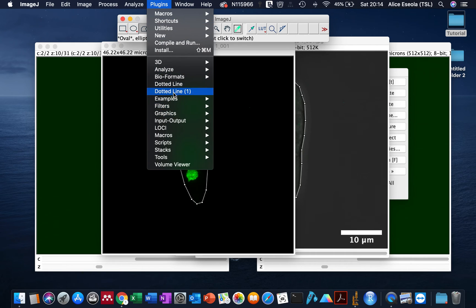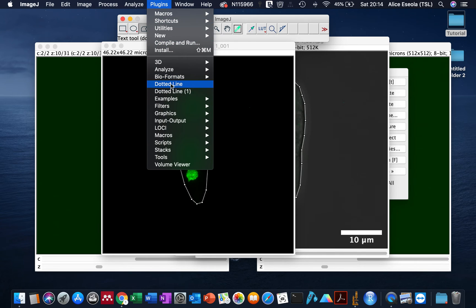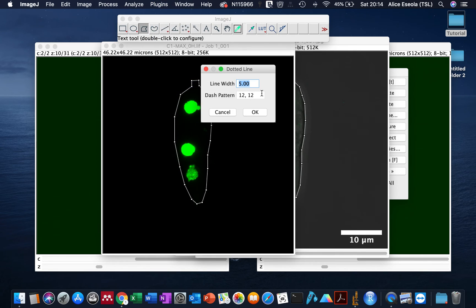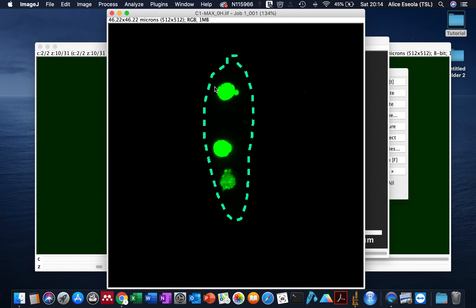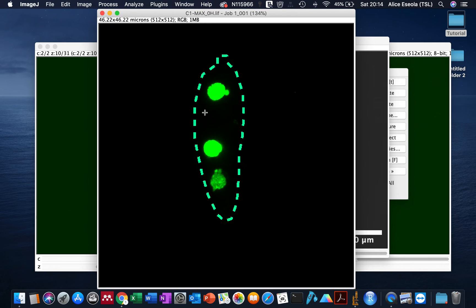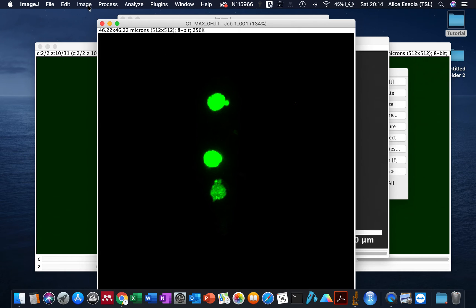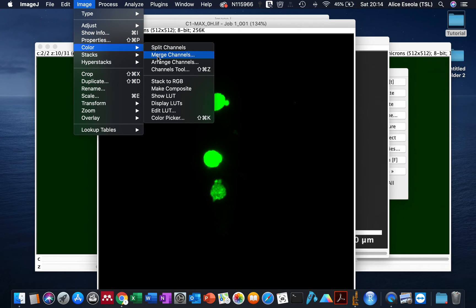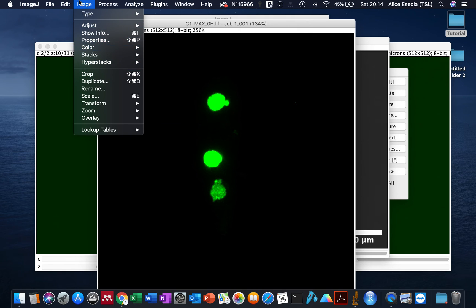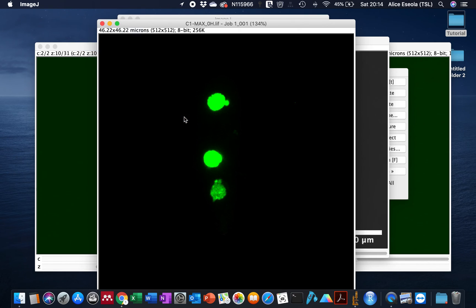I'm going to select this dotted line plugin. By default it will give you a line width of 5 and the space between the dash pattern of 12, which is okay for standard use. If you observe, my dotted line has been drawn in green. If you do not require a green outline, once this dotted line has been drawn you can undo it by clicking Control-Z. With that, you can then change the color of the outline. Let's assume we want a white outline. Go to Image, Color, Color Picker and then choose white.